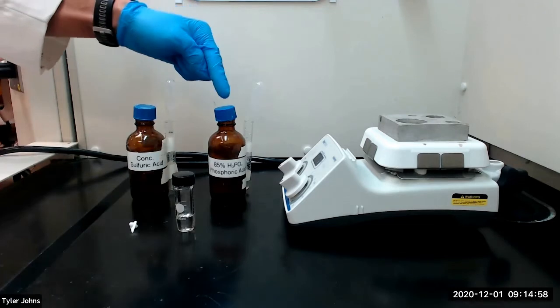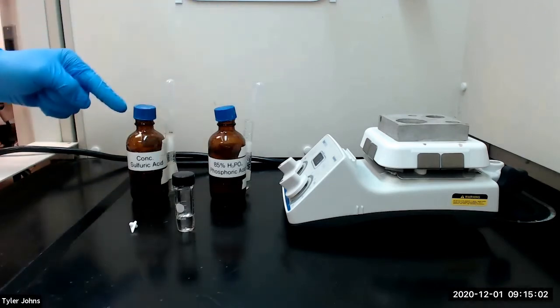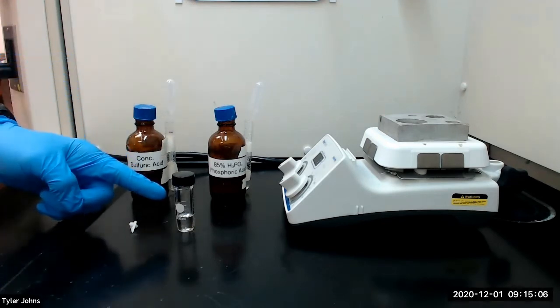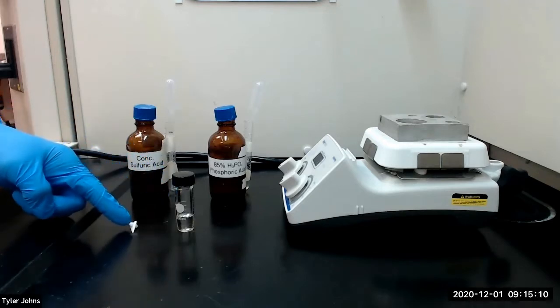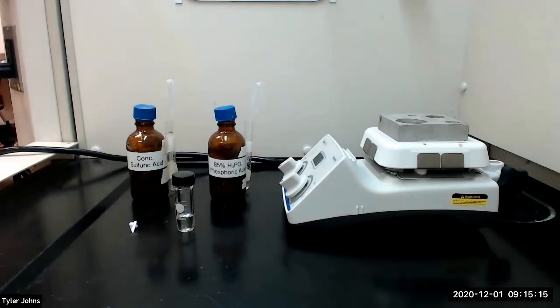We will next add 0.4 milliliters of 85% phosphoric acid and 6 drops of concentrated sulfuric acid to the conical vial with our 4-methyl cyclohexanol. We will then add a spin vane and stir the liquids on a magnetic hot plate. After mixing, we will connect our conical vial to the distillation apparatus.